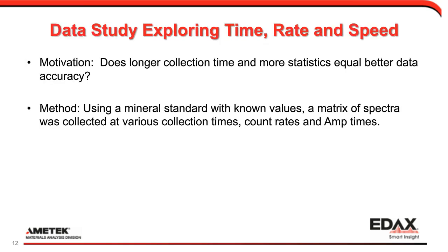We'll turn over to Tara now, but just before anybody cries foul and says that, well, this is a silicon dioxide, peaks are nicely separated, and resolution doesn't really matter for this, so the data is not valid, that is a very good point, but at the end of this, we will show you a galena sample to address all that. But for now, let's turn over to Tara, and she'll explain a few things that we did to illustrate these points.